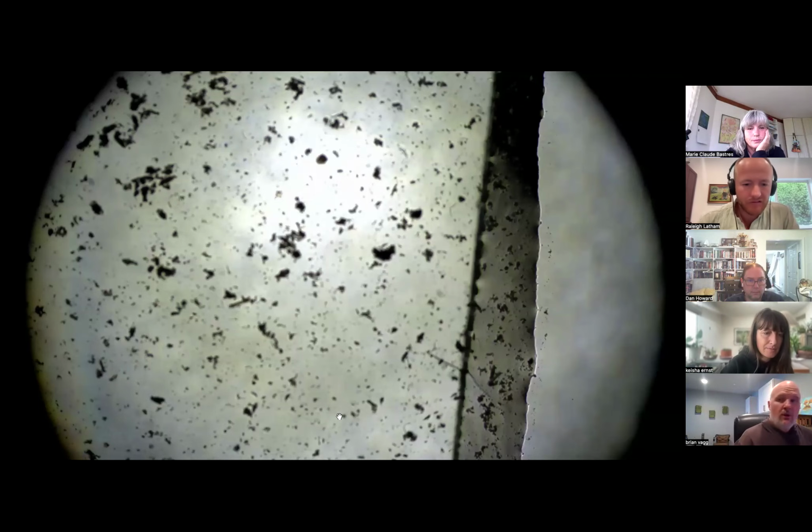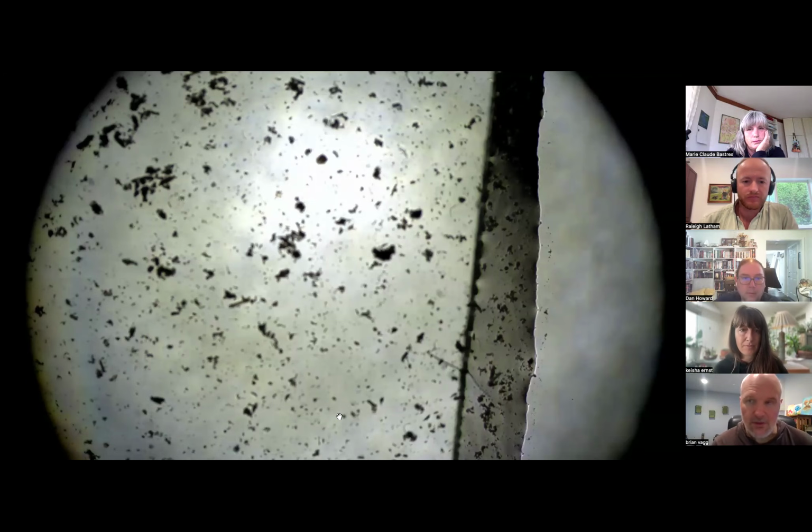Nice. All right. So, you guys, I'm going to share with you two different soil samples. One that we're looking at right now is coming from one of my garden beds. So, give a little bit of context about this because it's always helpful when we are talking about soil samples to give everybody some context behind it so that you know what's been done and what is the condition of the soil. So, this is in one of my raised beds, and this is a raised bed that was created about 3 years ago.